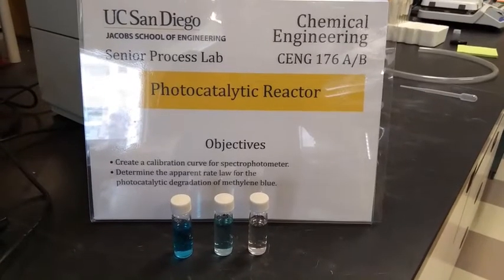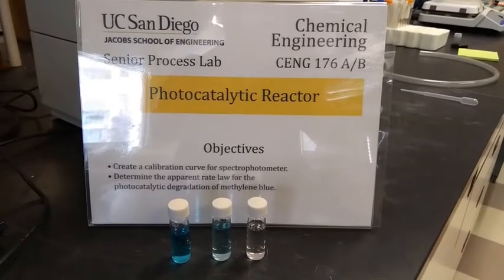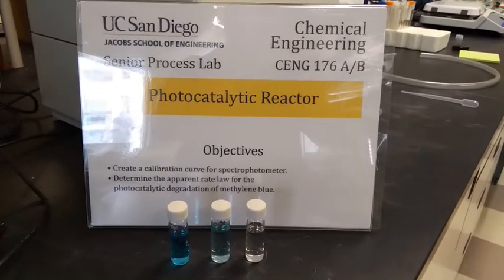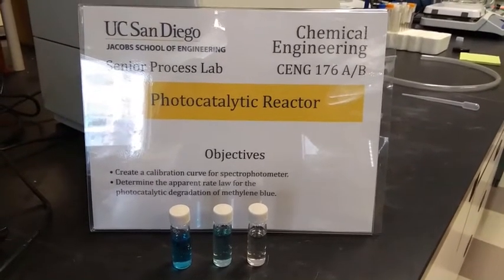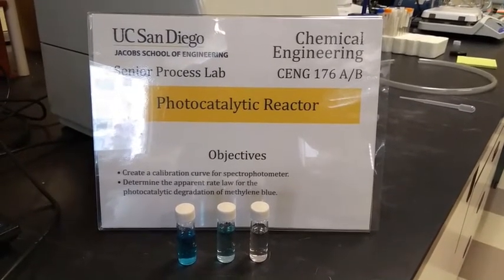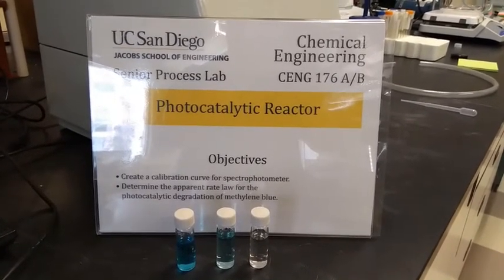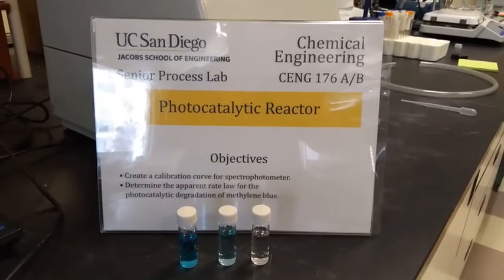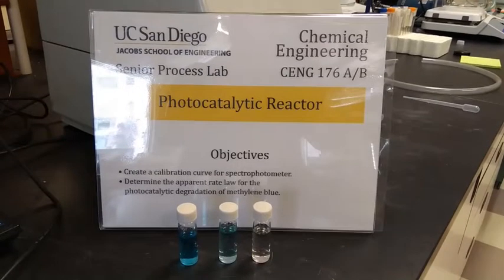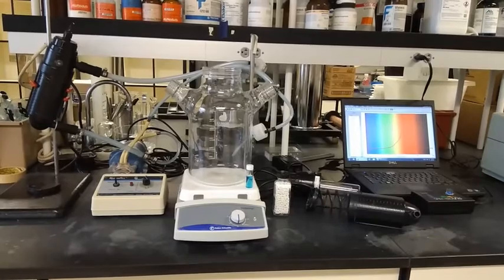My name is Sabine, and I am one of two engineers who keeps the chemical engineering undergrad lab running smoothly. James is the other engineer, and you will meet him in the video of the reverse osmosis. I wanted to show you briefly today the parts of the photocatalytic reactor experiment, and then we will show you a short video of the actual experiment that one of our students made a few years ago. Here is the overall setup of the photocatalytic reactor experiment.